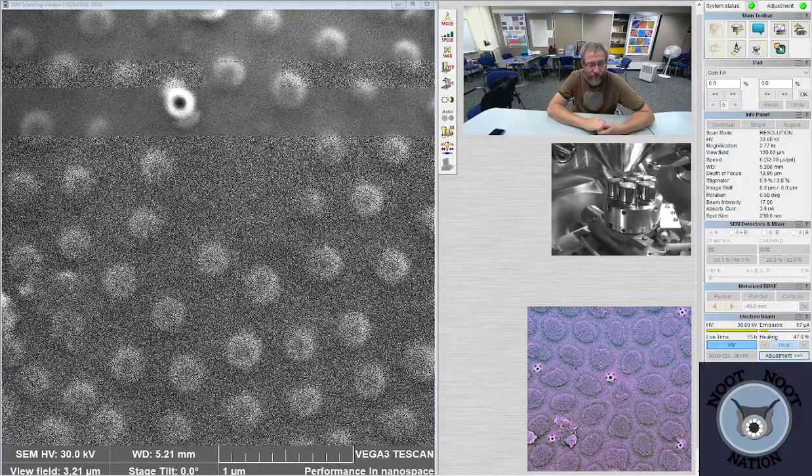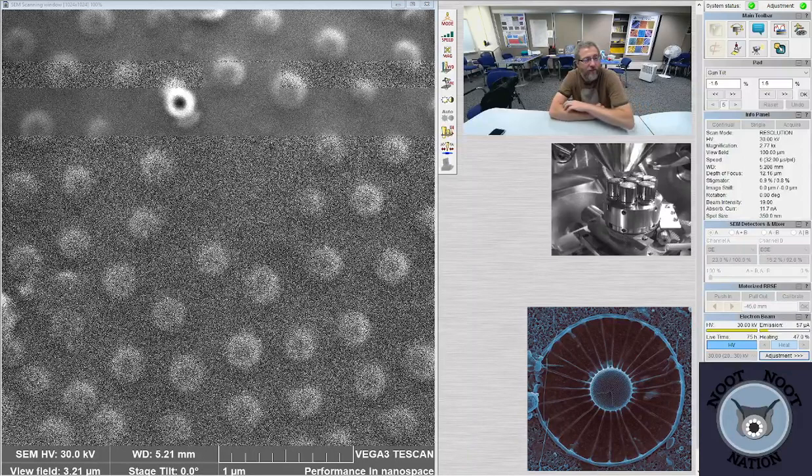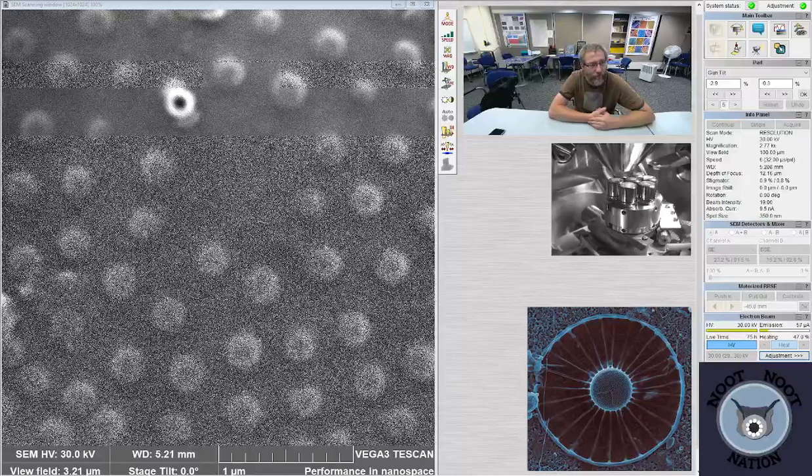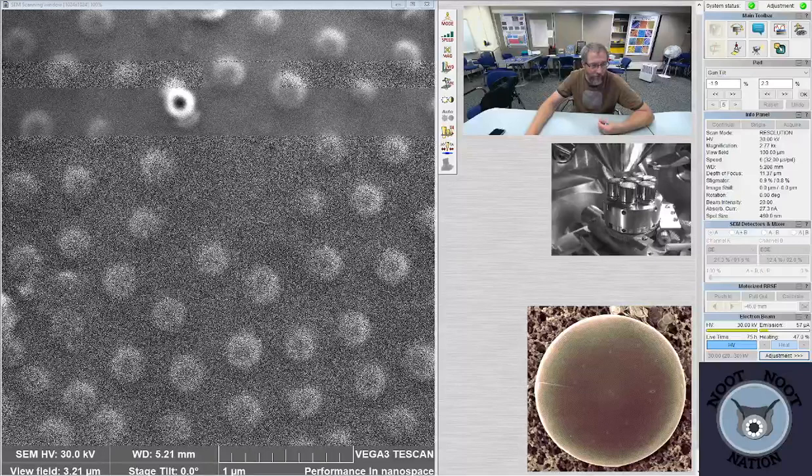The filament is basically just a piece of metal between two posts, and it runs electricity through, but also heats it. And the heating is basically the finer adjustment that it makes. Together those two things get you in an ideal setting for your combination of temperature and voltage. It was doing that, and now it's doing automatic gun centering, which usually has to be done after the filament's been adjusted for heating.